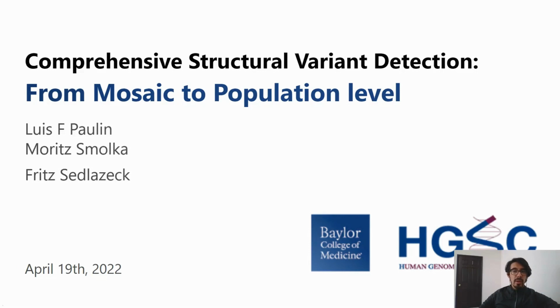And today I will talk about Sniffles 2 and how it enables comprehensive population structural variation detection from mosaic to population level. Let's start.